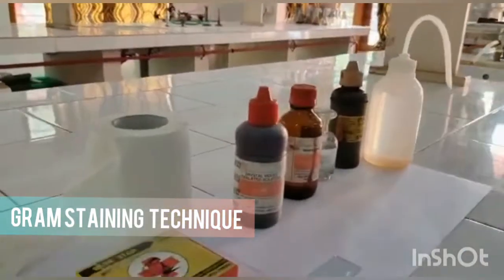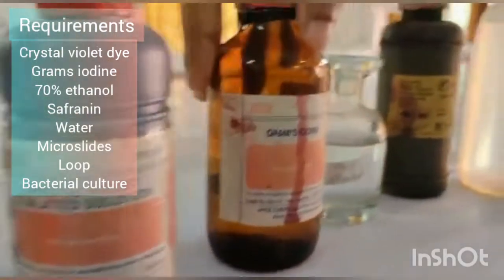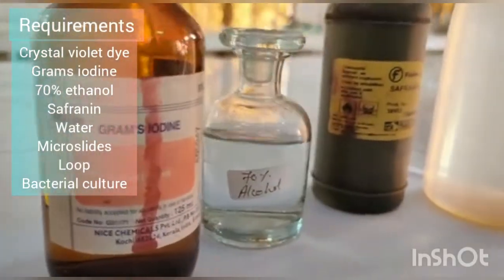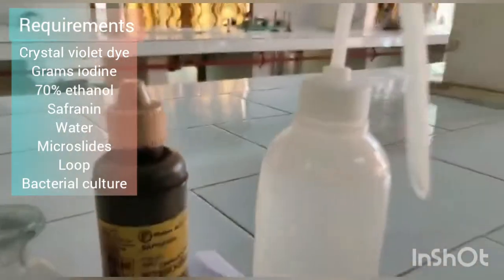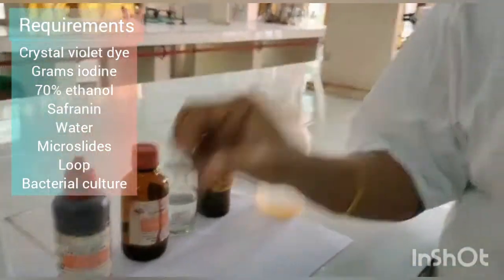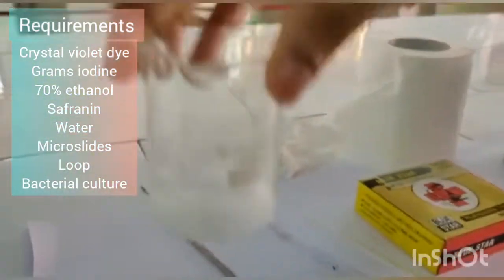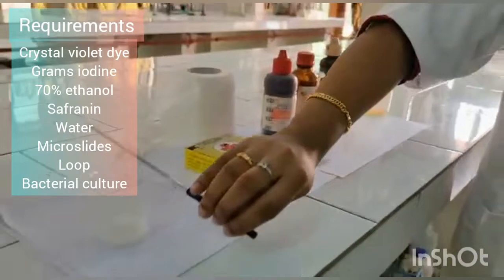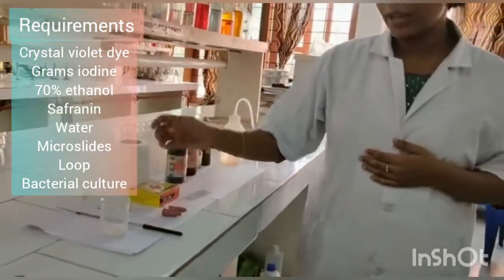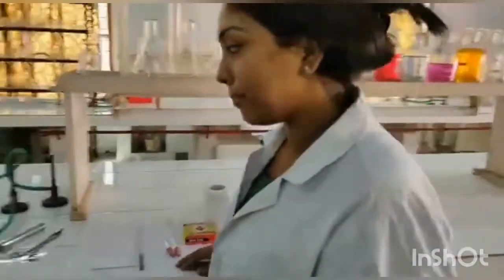Let's see what the requirements are for the experiment. You need the crystal violet dye, Gram's iodine, 70% ethanol, safranin, and distilled water. Then you need the main thing, the micro slides. You have the bacterial culture here. I have taken curd, and then a loop and also a dropper for applying the primary stain on the slides.